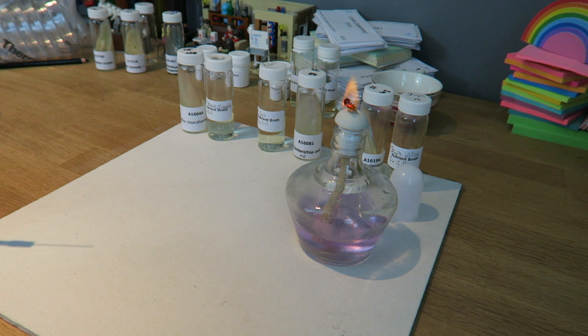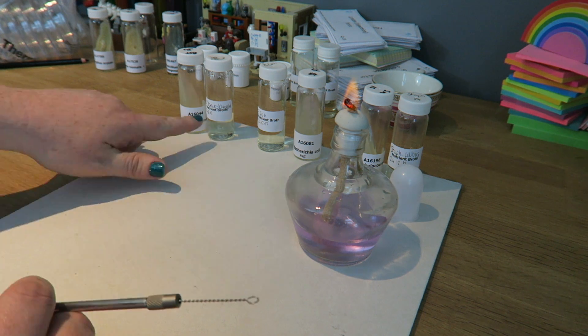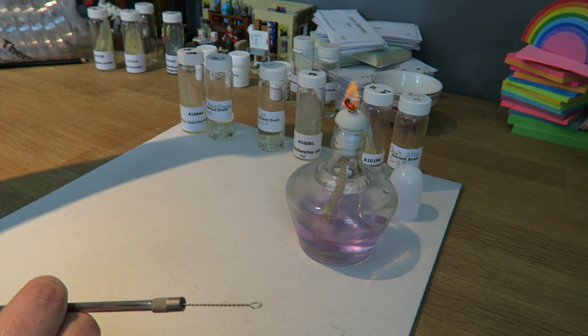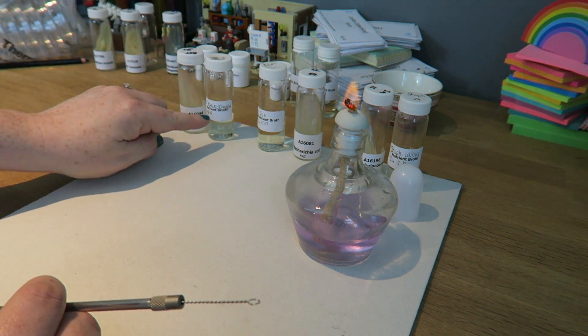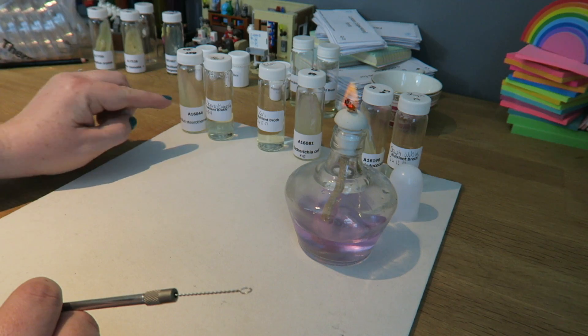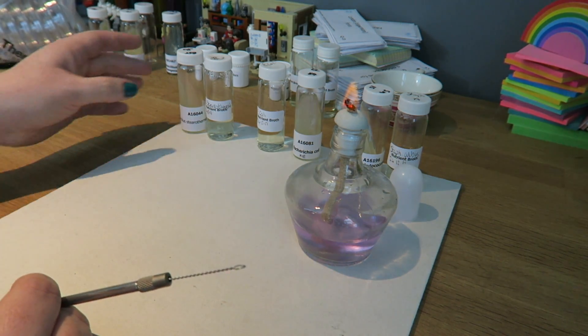One of the most important things when we are working with microbiology is to keep everything sterile and do things quickly. The best way to do that is to be organised before we even start. So I have all of my cultures that I'm going into labelled, next to the ones they are coming out of. They're labelled on the lid and on the bottle, so there's no mix up and I know exactly what is in each one.